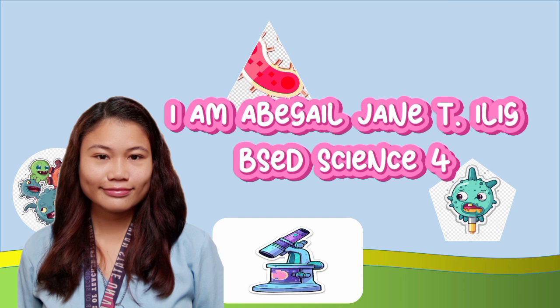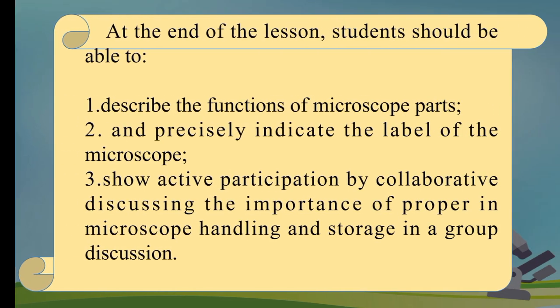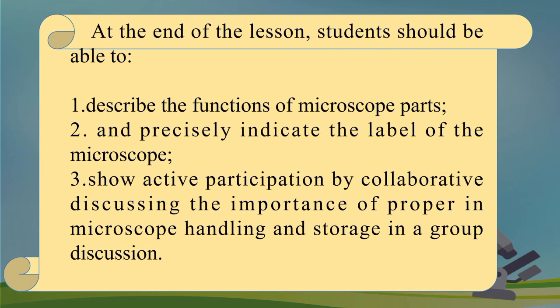And today, the lesson that I will discuss is the compound microscope. But before that, let me read to you our learning objectives. At the end of the lesson, students should be able to: first, describe the functions of microscope parts; second, precisely indicate the labels of the microscope; third, show active participation by collaboratively discussing the importance of proper microscope handling and storage in group discussions.